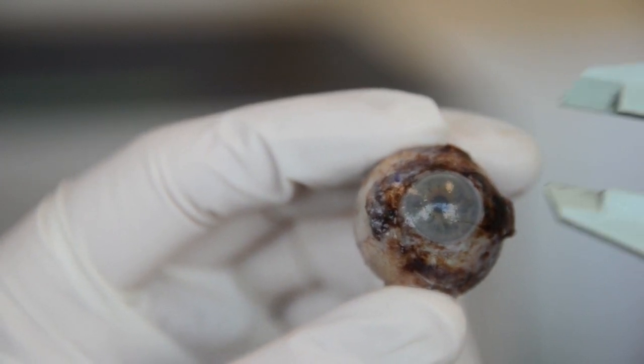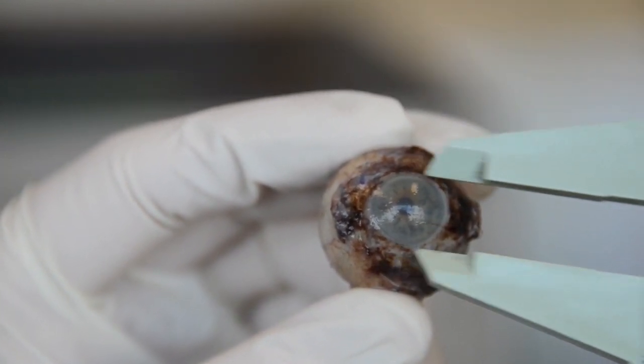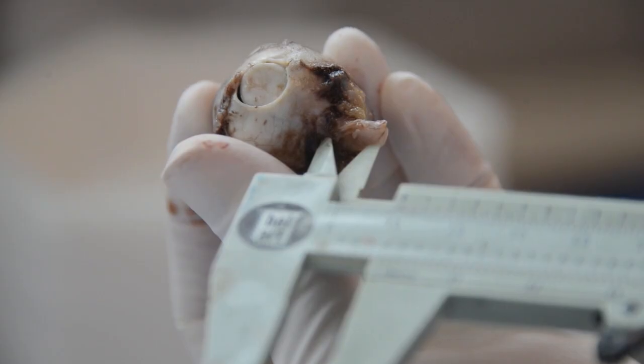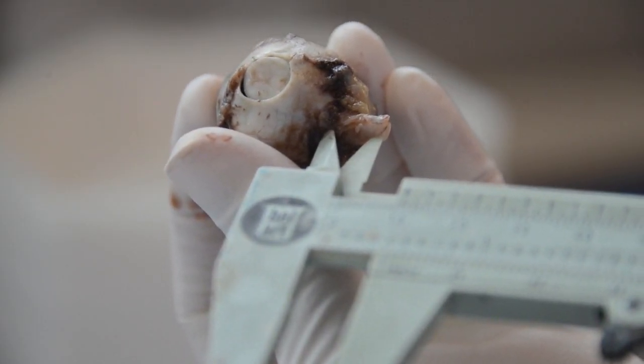Then, the horizontal and vertical diameters of the cornea are measured. The diameter of the pupil is measured, and the color of the iris is recorded. The final measurement is the length of the segment of optic nerve attached to the globe.